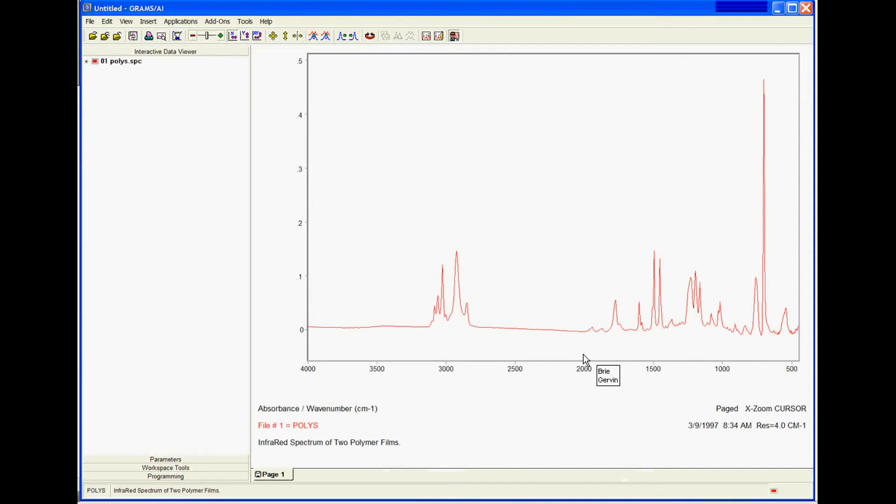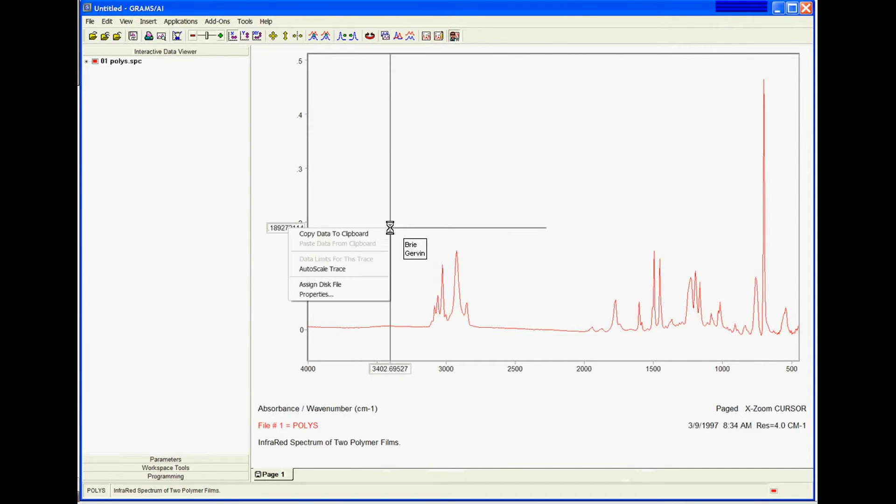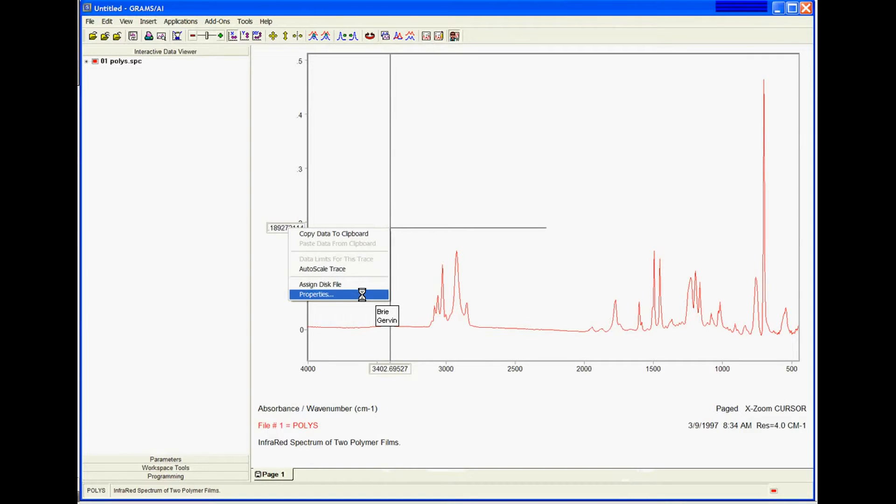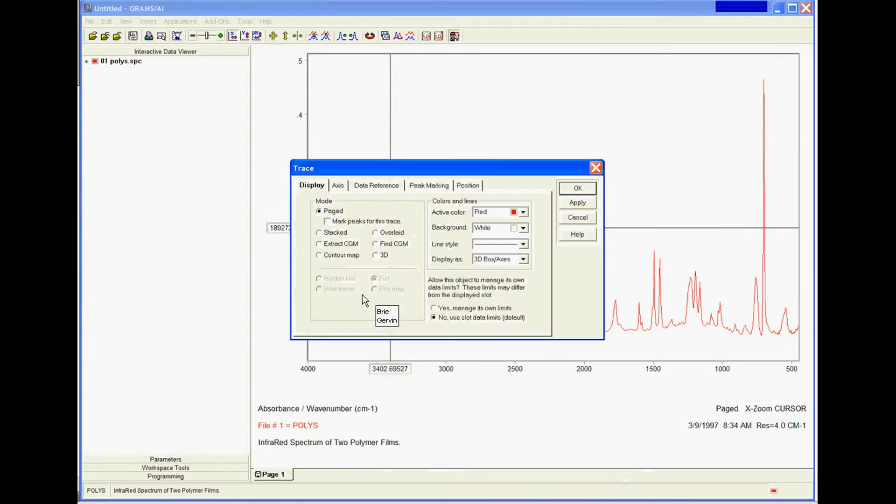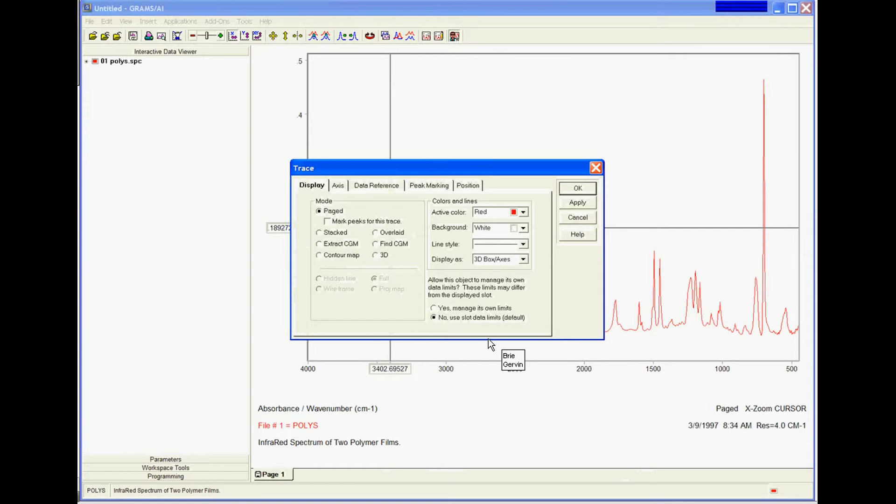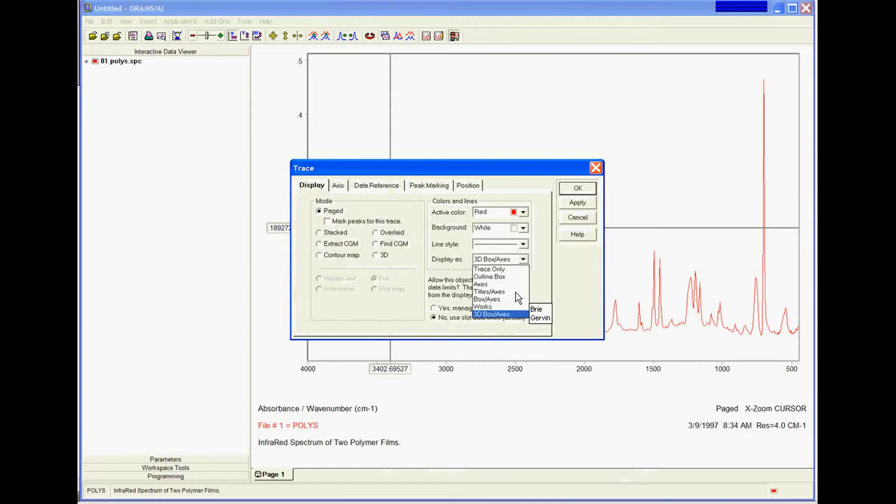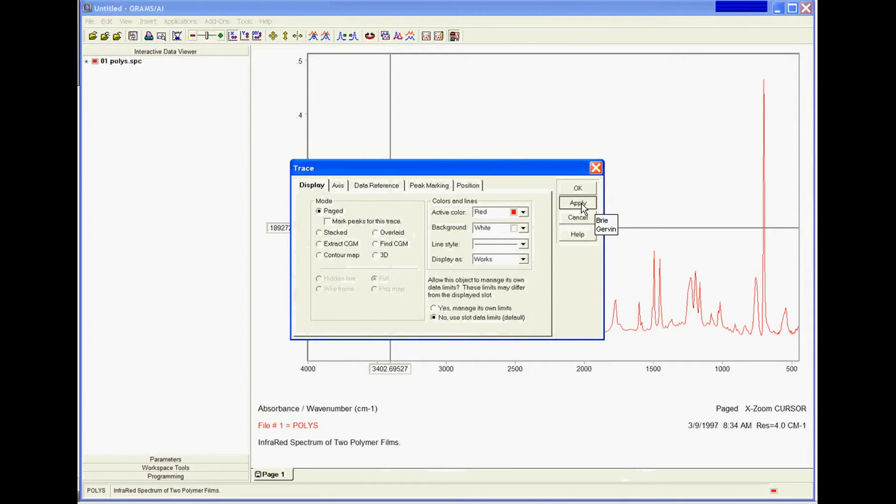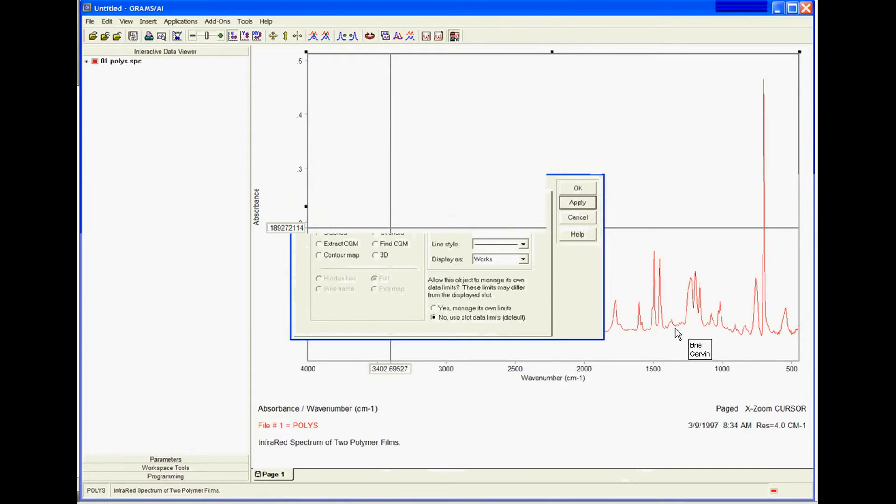I'm going to right-click on the spectral display and choose Properties. Because I want to change my axes a little bit, I want to see my labels right here on the plot as opposed to down here on the page. I want to change the display as it works, Apply, and OK.